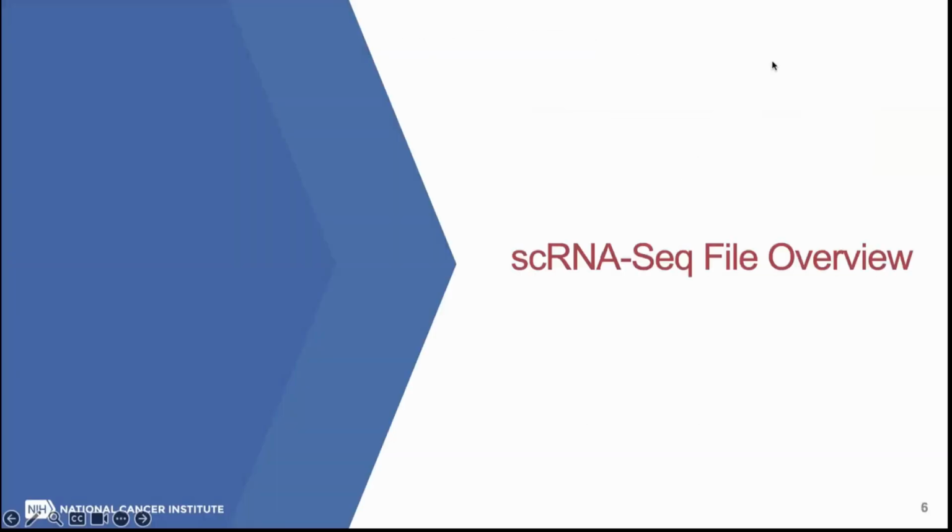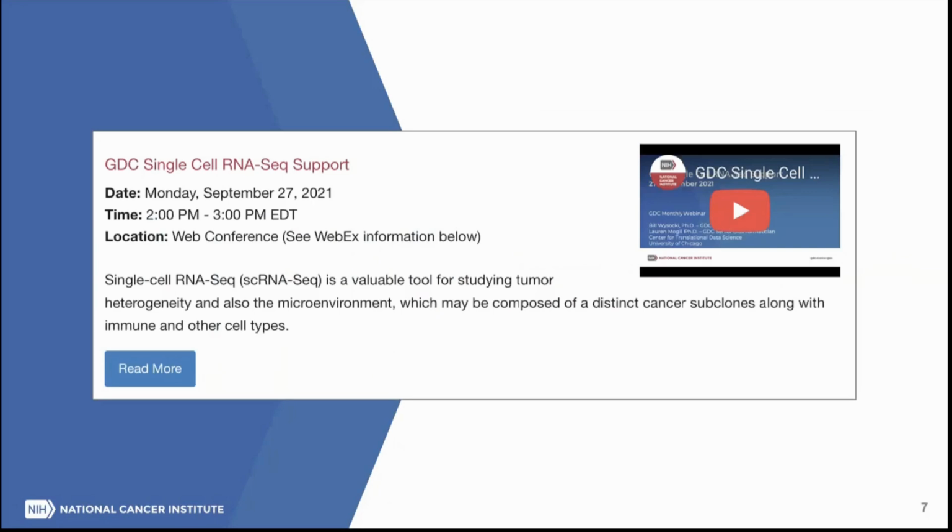Thanks, Zenu. So just to go over some of the files that are available for single-cell RNA-seq. But before I do that, I just want to let everyone know that what I'm going to present right now is an abridged version of a webinar that we did in 2021. So if you're interested in a more in-depth presentation of the single-cell RNA-seq data that's available, I would recommend going to look at this webinar, and I'm going to show you how to get to that at the end of this one.